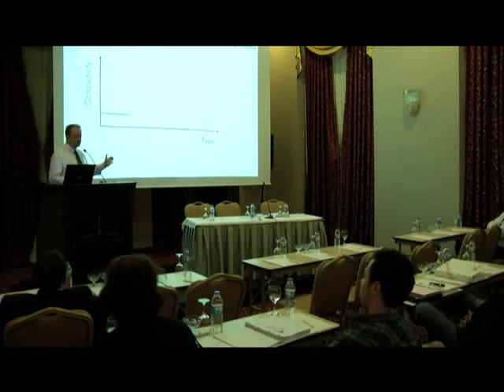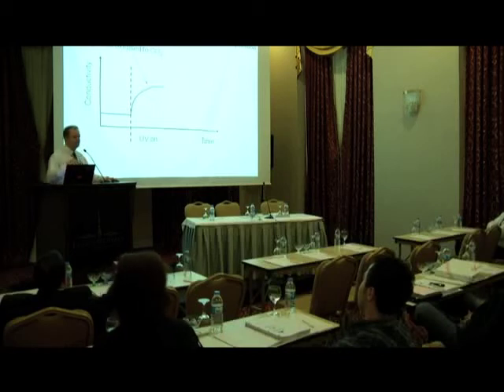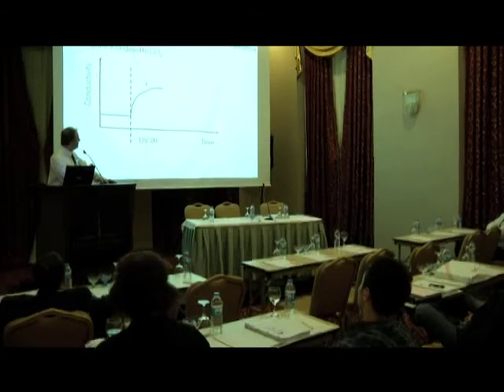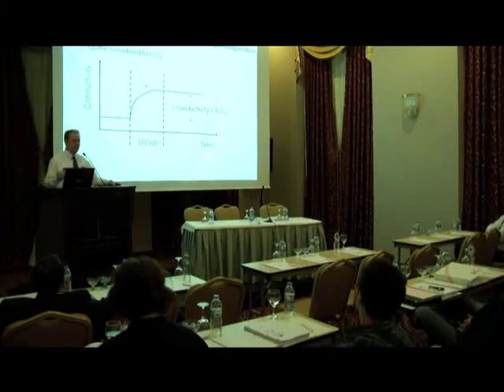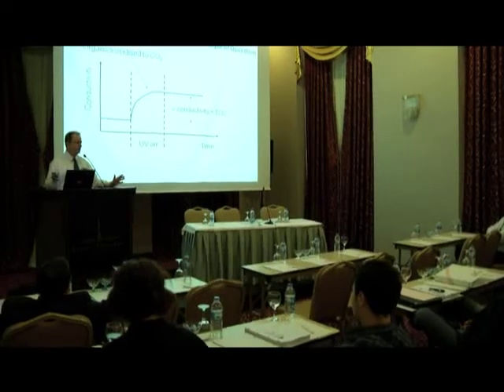So first of all, as I mentioned, we capture a sample of the water, we measure the conductivity. Then we turn the UV lamp on, that oxidizes all the organic material down to carbon dioxide. That carbon dioxide contributes to the conductivity, and we see the conductivity increase. When it finishes changing, then we know that we've oxidized all of the organic, and that change in conductivity is directly proportional to the amount of organic carbon in the water.